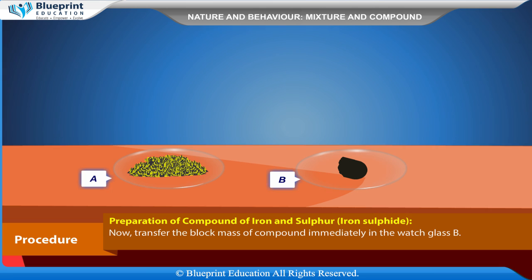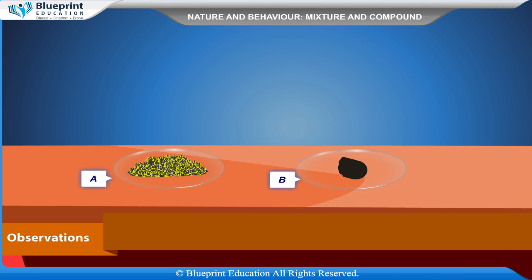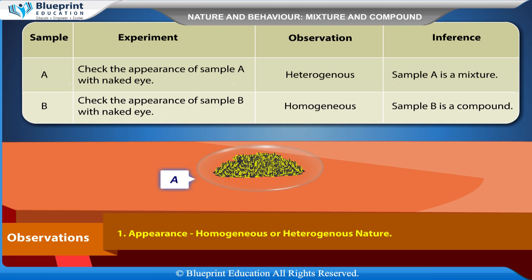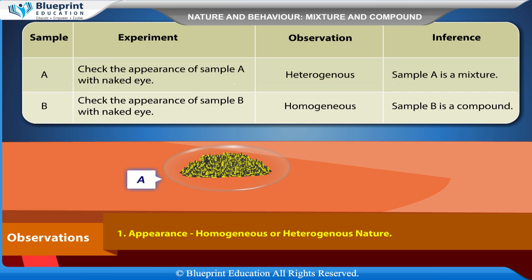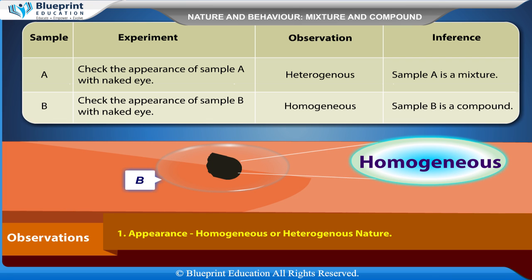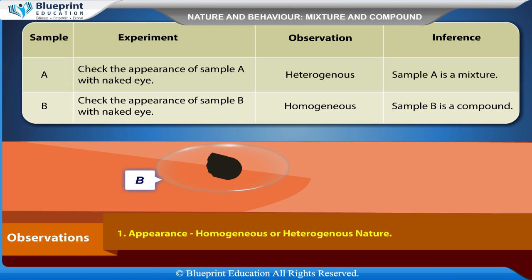This is because iron reacts with sulfur to form a compound called iron sulfide, which releases heat energy. Transfer the black mass of the compound immediately into watch glass B. Observations — Appearance: Sample A is heterogeneous; inference is that sample A is a mixture. Sample B is homogeneous; inference is that sample B is a compound.